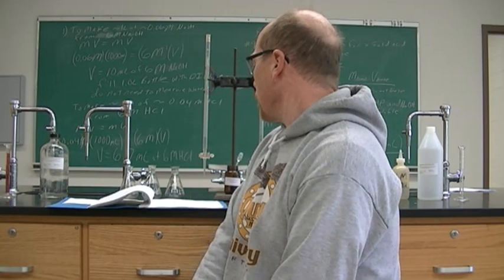We are not going to measure the water. We will measure the acid to make sure we have an approximate correct solution. We're going to do the titrations to get the actual concentrations to 4 significant figures. All right. So on the board I have the calculations. I will show you the calculations.